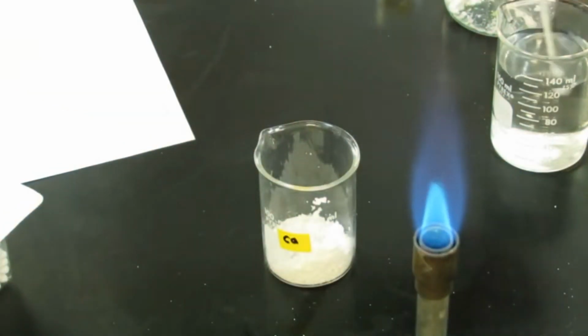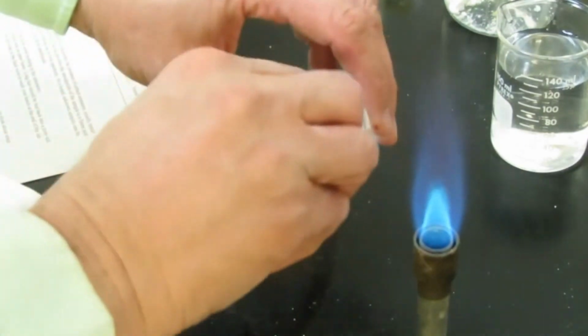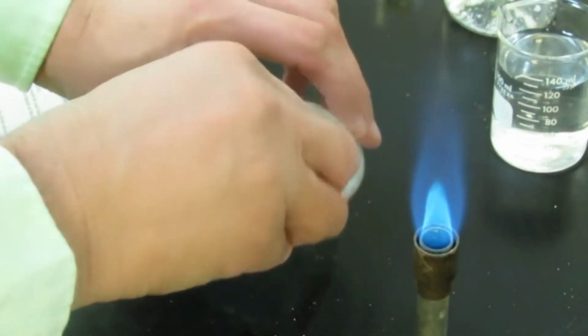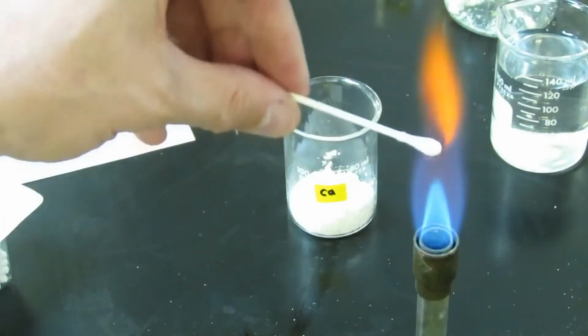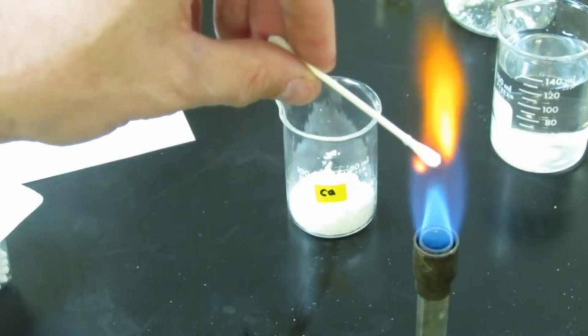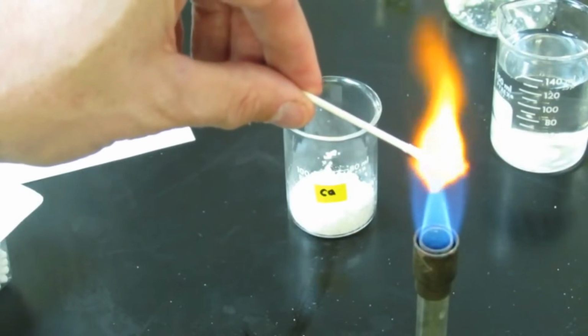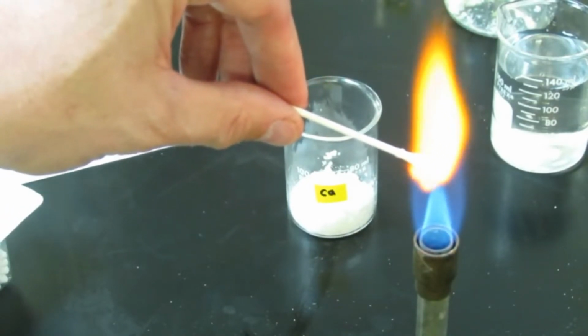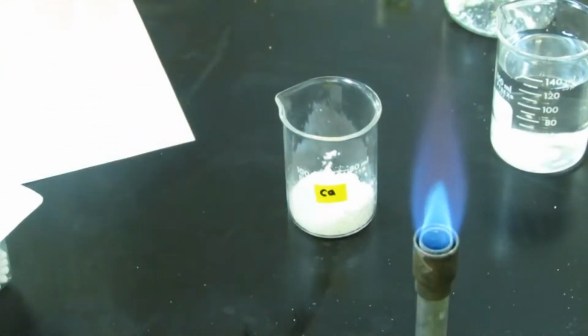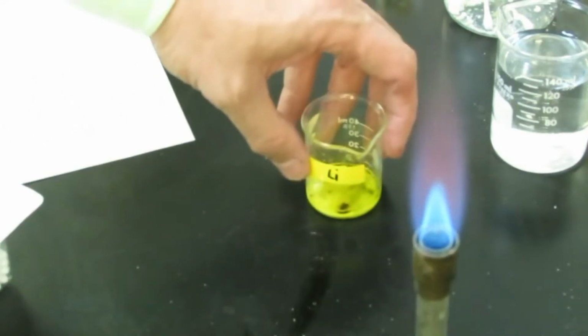Next in our Q-tip. And we'll get some calcium salt on the tip. And we'll do that one. And then our final known looks like it's lithium.